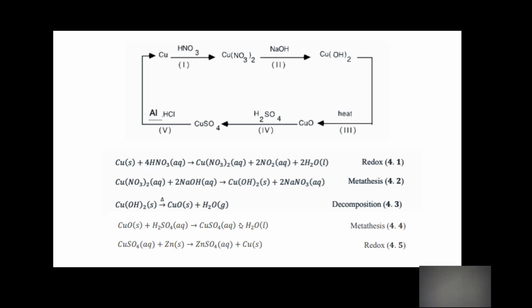Now these don't include all the materials you've used. That would have to be involved in the reading. So make sure you understand these are just highlights of what the reaction was.